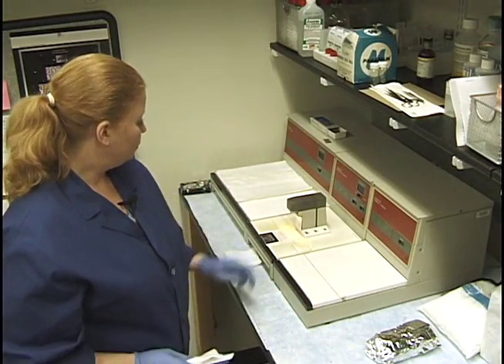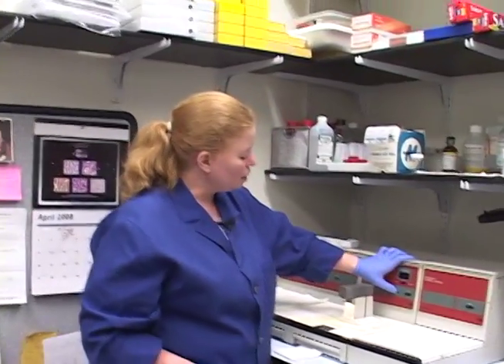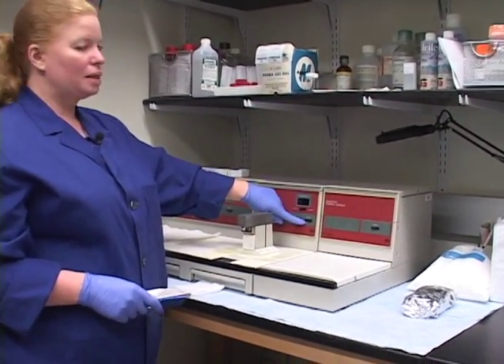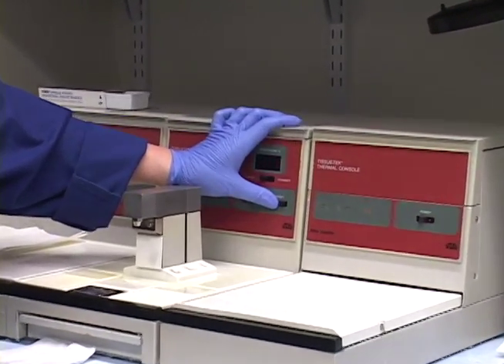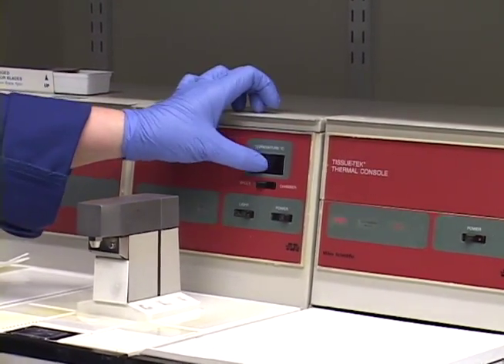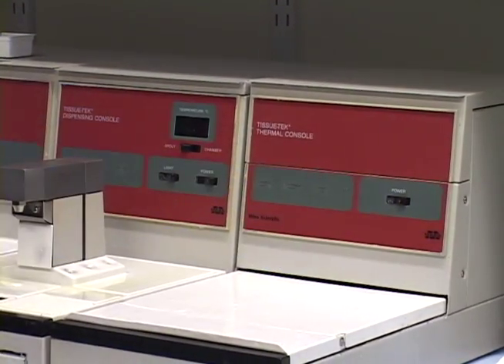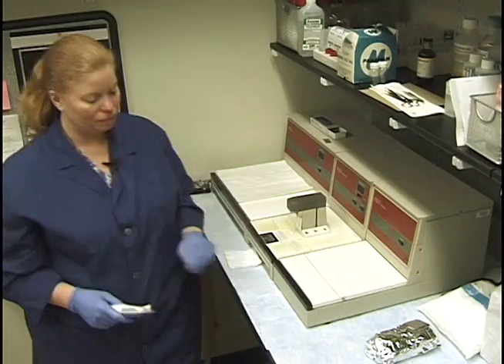Moving right along - turn this off. Turn the light off, you don't want to waste the light bulb. Turn this power off - this power button sometimes doesn't come on right away, so you might have to wiggle it a little to get it to come on. Make sure it lights up; if not, wiggle it a little. Then turn this off and of course the thermal console or cryo console is off.